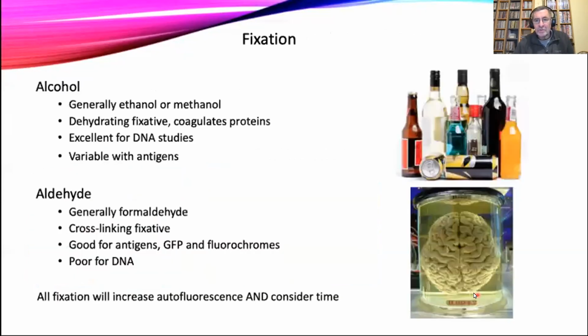So fixation we've touched upon several times during our webinars, and we will do in our next one, in fact, as well. Often we're going to have to fix our cells for many reasons. We might have an infective cell. We might want to store our cells so we can run them when it's convenient to us. And fixation is going to stop your cells. It's going to stop any physiological processes, so they should remain in stasis until you're ready to run them.